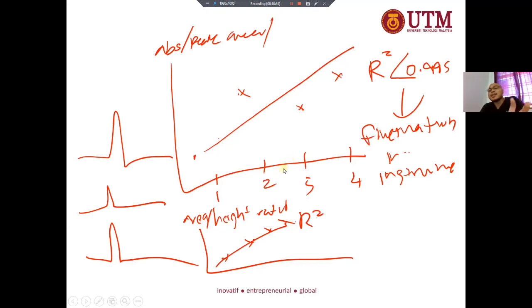Okay, that is a very tricky situation where you have a complex matrix, but at the same time you also encounter fluctuation of the instrumentation reading. So you need to combine the application of the internal standard and also the standard addition. Pray that never happens in your life. But in my case, I believe mostly all my students' analyses using gas chromatography will have that kind of problem.